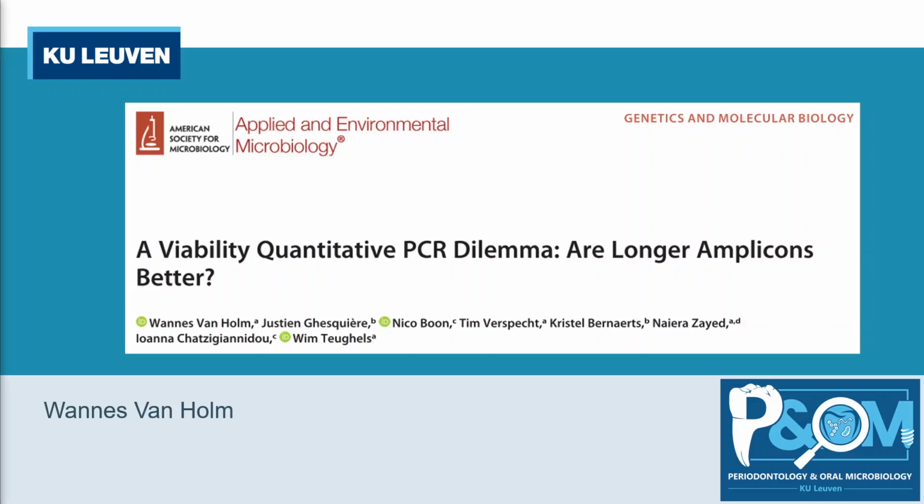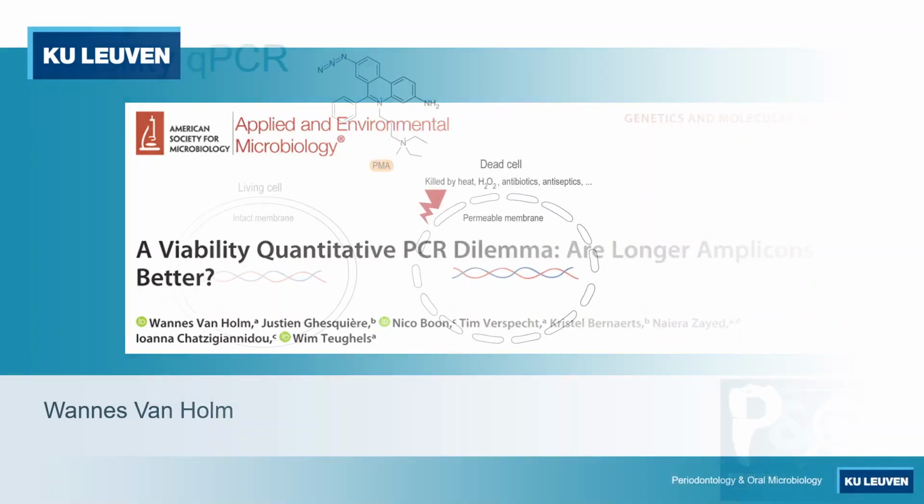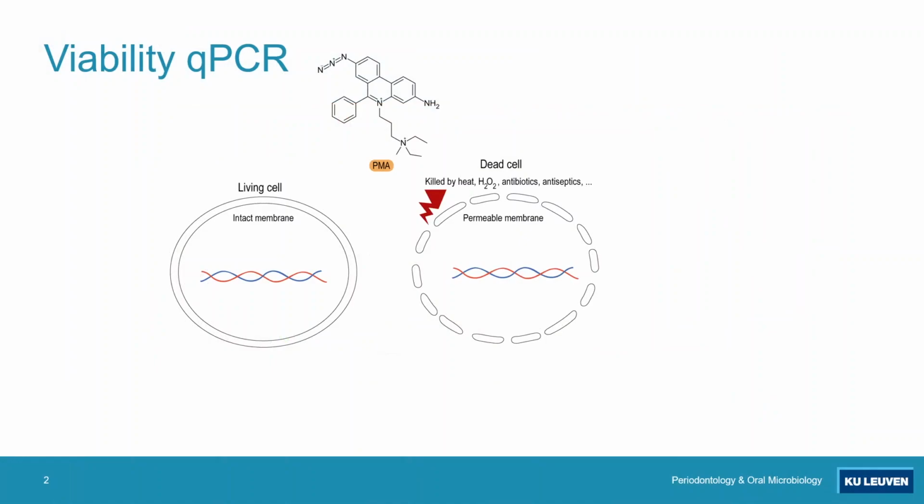Hi, I'm Wannes, and I would like to present to you our study on viability qPCR, published in Applied and Environmental Microbiology. Viability qPCR is a technique that allows us to detect the DNA of living cells specifically through discounting that of dead cells.